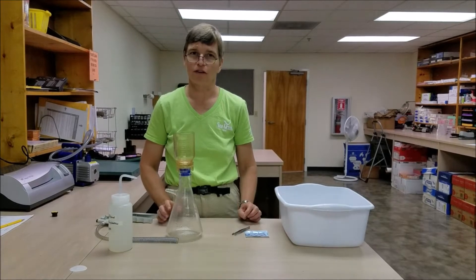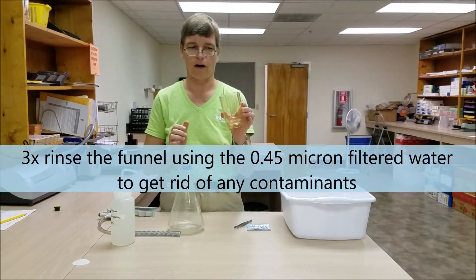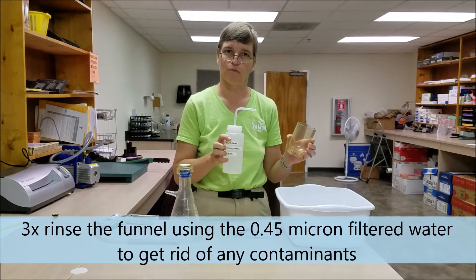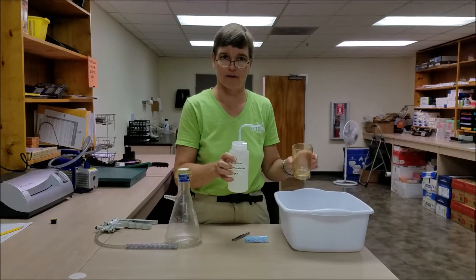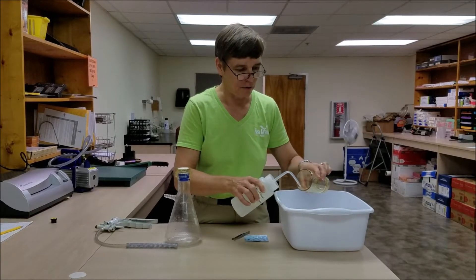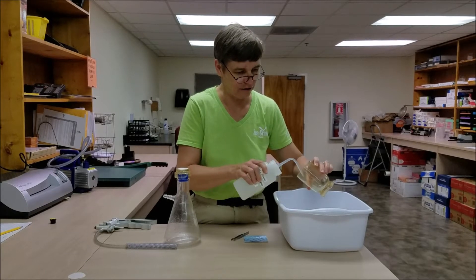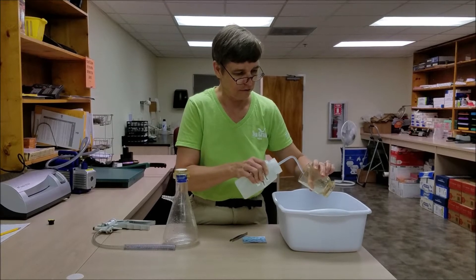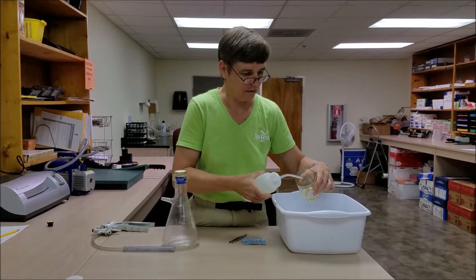When we're ready to actually filter a sample, the first thing we need to do is triple rinse the top part of our filter holder. We need to use our previously filtered water to do that — this can be sea water or tap water, as long as it's been run through a 0.45 micron filter. We want to rinse the entire inside, making sure the water runs completely down the sides, and rinse it three times.